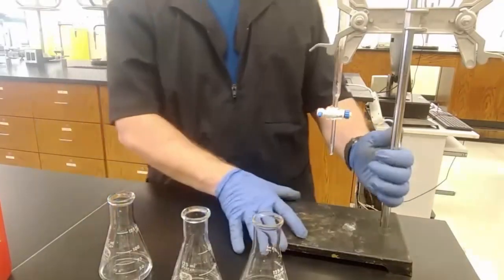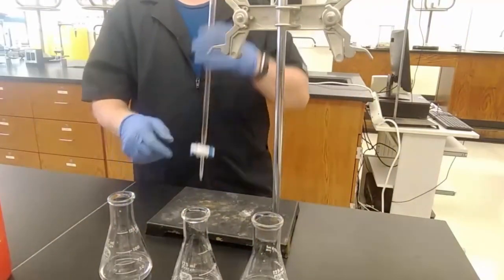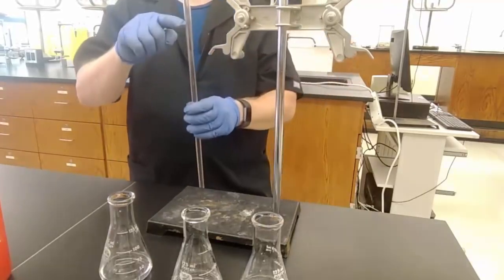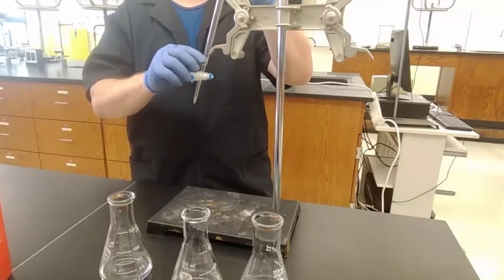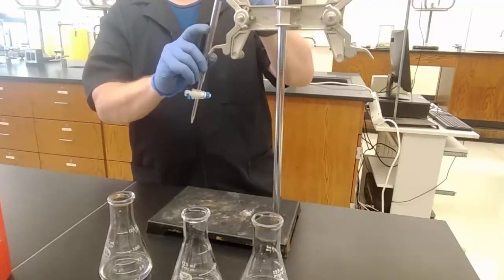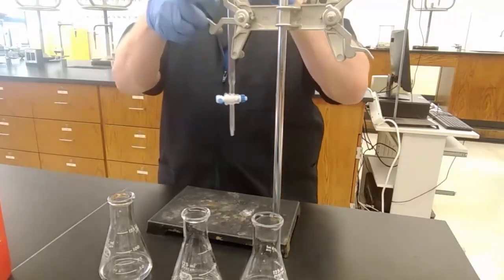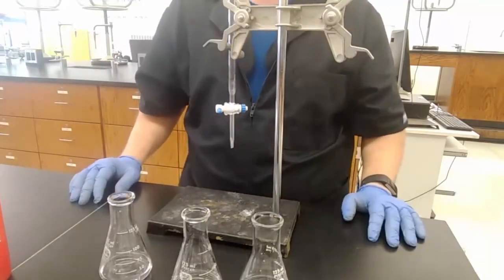Step 6, we have clamped a burette. Long glass tube with a valve at the end, which is marked from 0 at the top to 25 at the bottom, in milliliters. It's in 1/10 of a milliliter increments. So 20, 20.1, 20.2, 20.3, etc., as we go down.